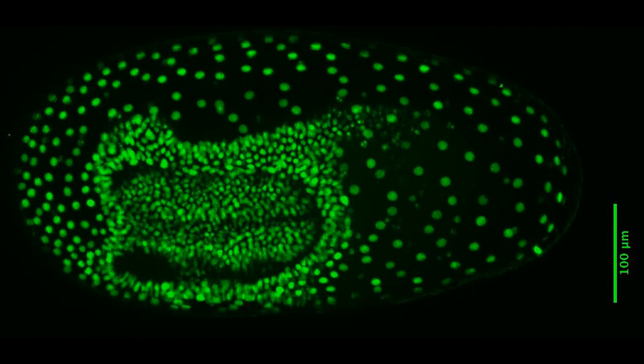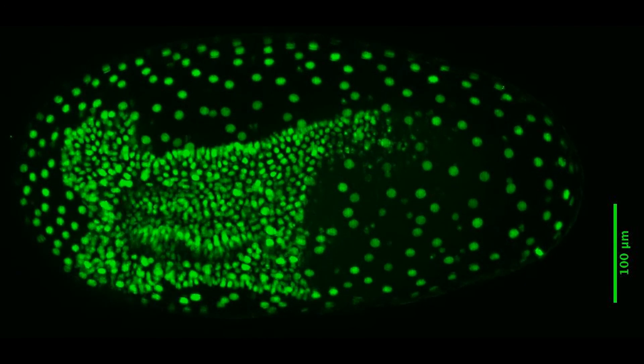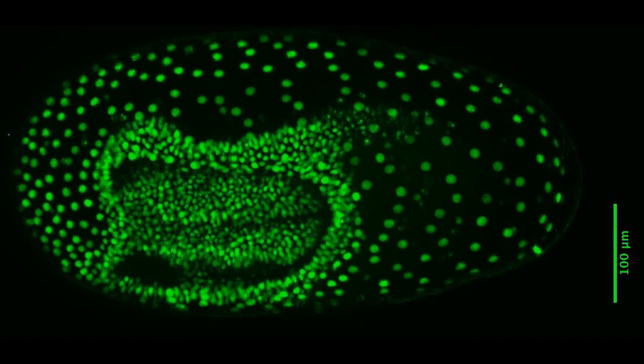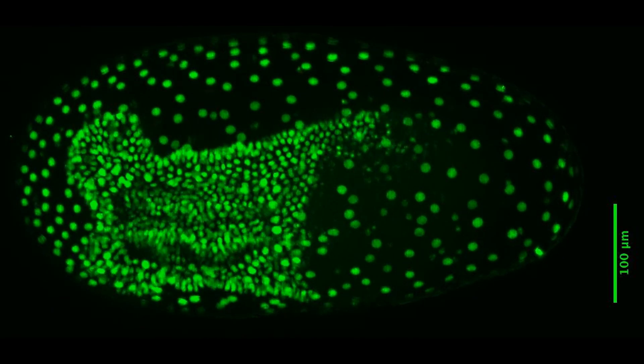Beautiful means that I can actually do live imaging where we've illuminated structures in the cell—for example, the nucleus or the outline of the cell—in fluorescent green or red, and you can actually really watch what's happening over time as the cells are rearranging in the tissue to make a new structure.